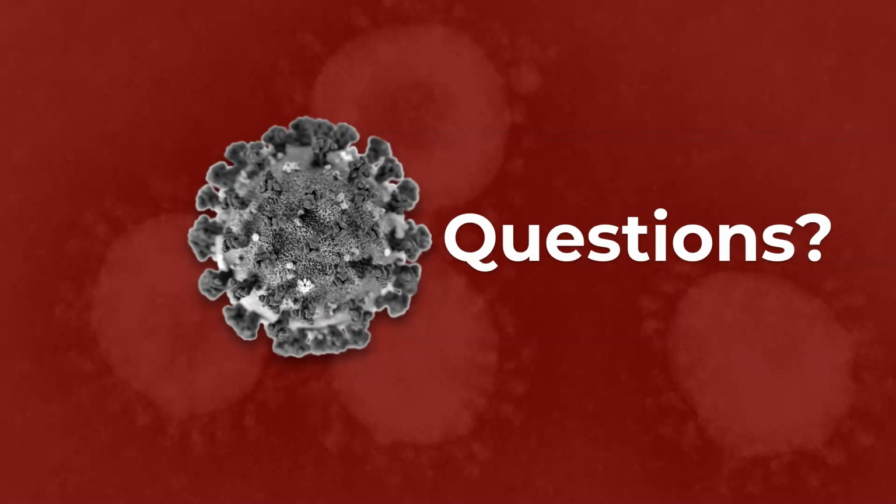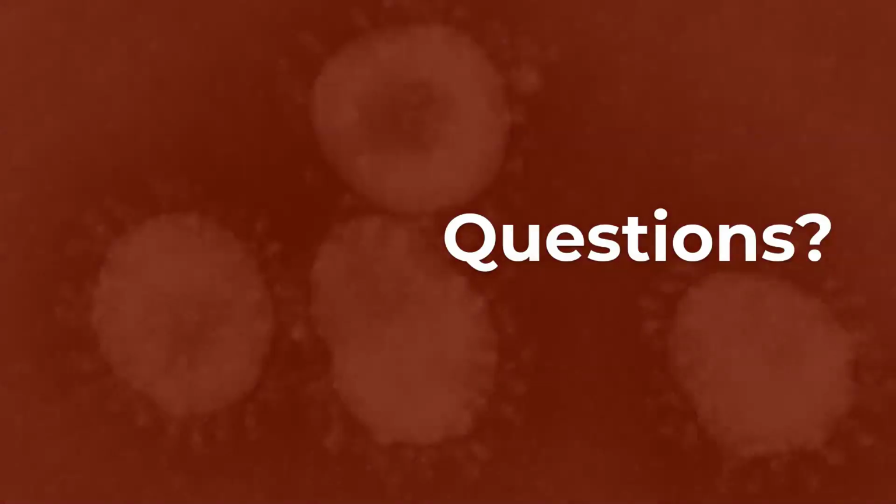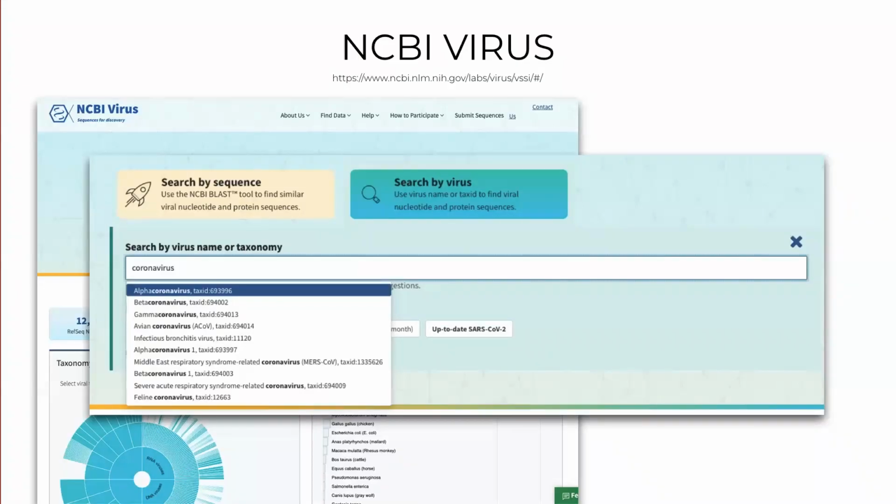So just to reset these steps, we're going to go to this link, and then we're going to look for severe acute respiratory syndrome related coronavirus, which has a tax ID of 694009.